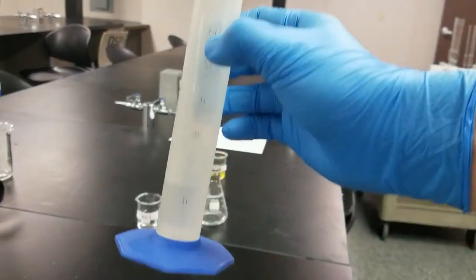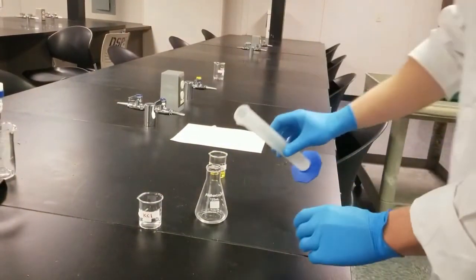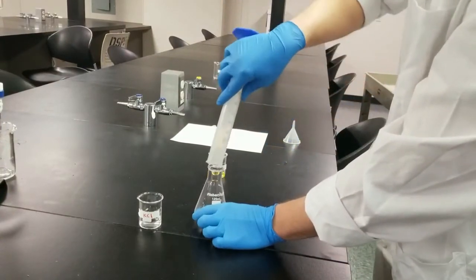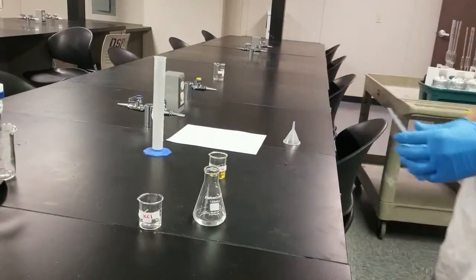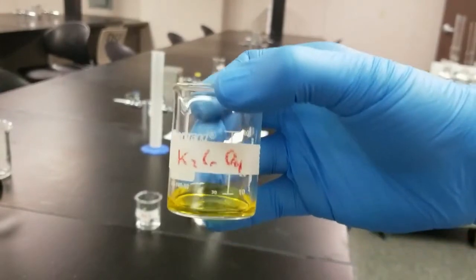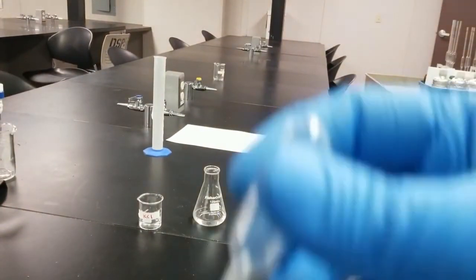So I've got 15 mils of water in this graduated cylinder. And then the next step is to add 1 mil of our indicator. In this case, it's this potassium chromate solution. So you can see it's a nice yellow. This doesn't have to be exact, so we're going to only add about 1 mil.